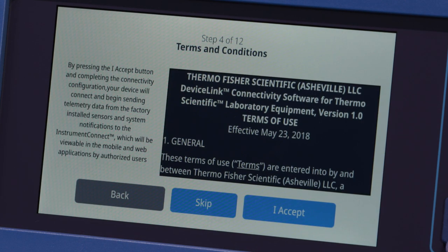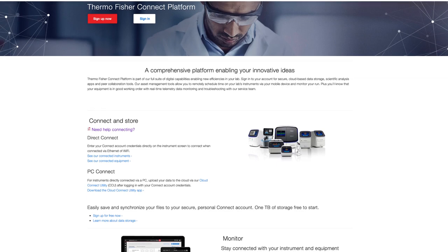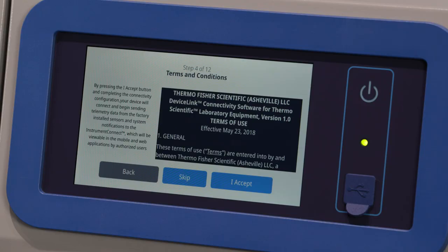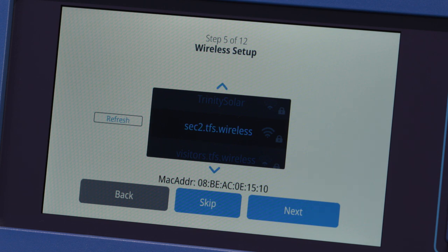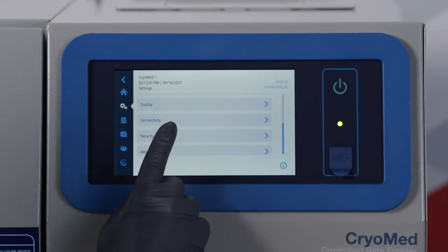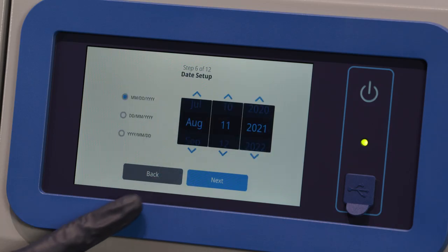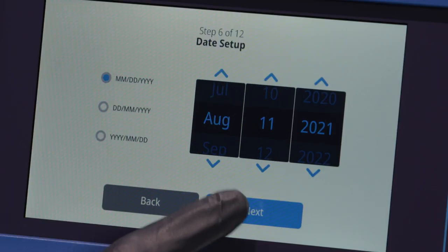The next few screens allow you to set up a wireless connection in order to store information on the Instrument Connect platform. Before you begin, establish a Thermo Fisher Connect account and have your network login information available. Refer to the Power Up section of the User Manual for more details. Accept the terms and conditions for connectivity on this device. If you choose not to set up a Wi-Fi connection, the Wi-Fi connectivity will be disabled. You will be able to enable connectivity at a later time via the Connectivity Settings menu. If you skip the acceptance, you will be navigated to the Date Setup screen. Select the preferred date format, then press the Next button.